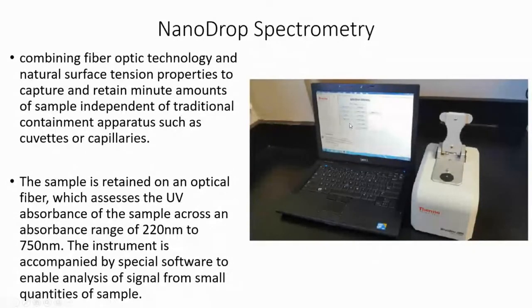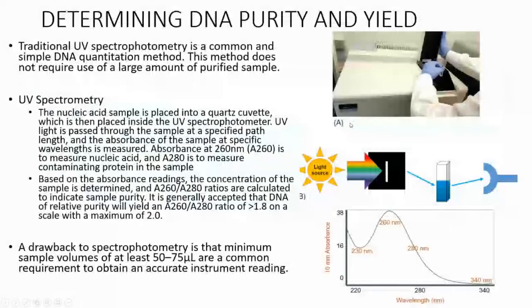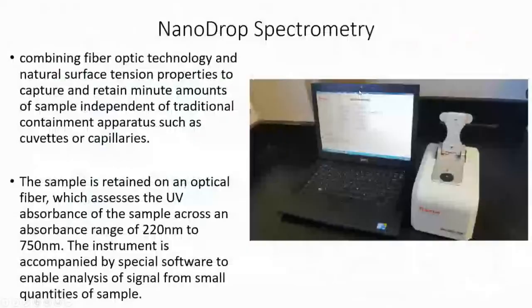And then that's a spectrophotometer. The regular spectrophotometer is huge and big. And nowadays we have this newer development called the nanodrop spectrophotometer. This picture is also taken from my laboratory. Each of these nanodrops is $15,000, very expensive. And you can see there's a tip here, and that's the place where you put one drop, like 1 microliter or 2 microliters of sample.